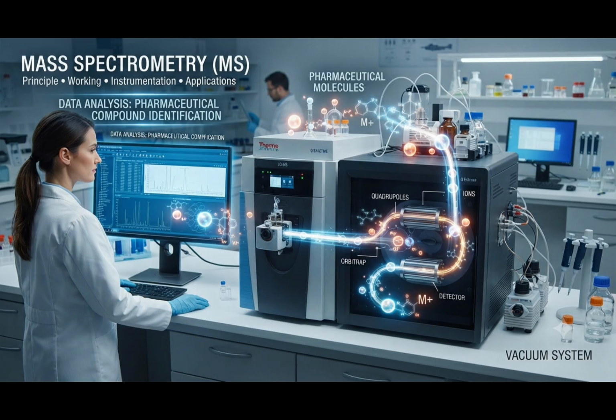Let's get started. Mass spectrometry, commonly known as MS, is a powerful analytical technique used to identify, characterize and quantify chemical compounds. The technique works by converting molecules into ions, separating these ions according to their mass to charge ratio, and detecting them to produce a mass spectrum.